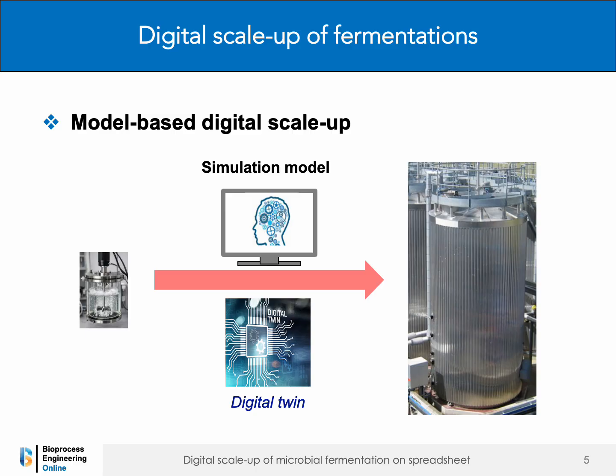These models act as digital twins, virtual representations of fermenters, enabling in silico experimentation under a wide range of operating conditions. Unlike empirical approaches, they allow virtual testing before implementation, thereby reducing costly pilot-scale trials and accelerating process development.